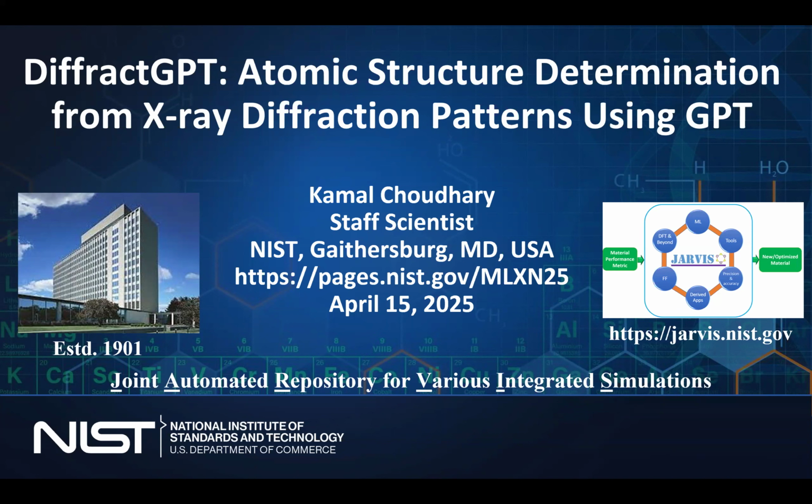Today, we're going to discuss DiffractGPT, atomic structure determination from X-ray diffraction patterns using generative pre-trained transformer models. This project is a part of a bigger infrastructure called JARVIS, which is available at jarvis.nist.gov, the Joint Automated Repository for Various Integrated Simulations.